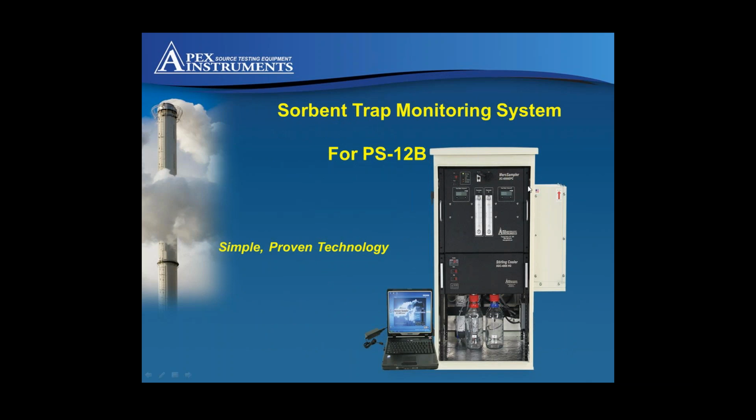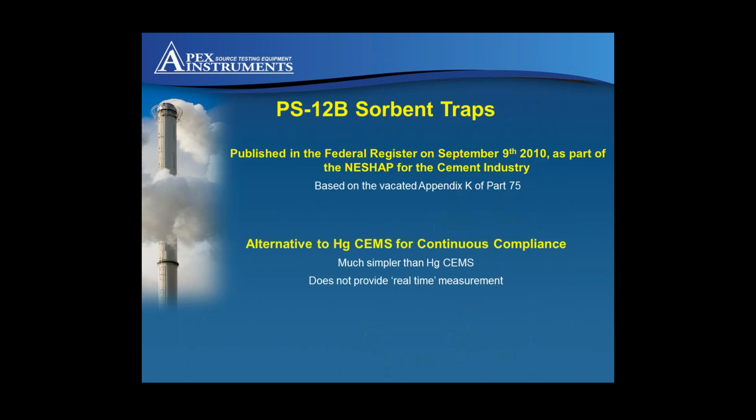And then the device is housed in a 20U cabinet with its own heating and air conditioning system. And then we have access to be able to get the test data via a laptop. Relatively simple package, one that we've had around for a long time. Obviously components do change, but we always look to improve the components when we have to make a change.